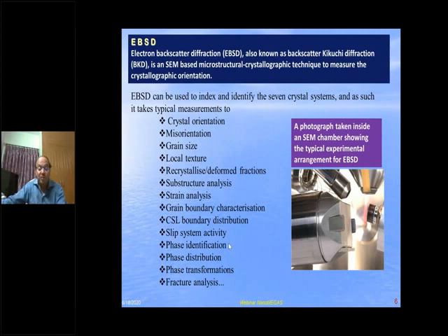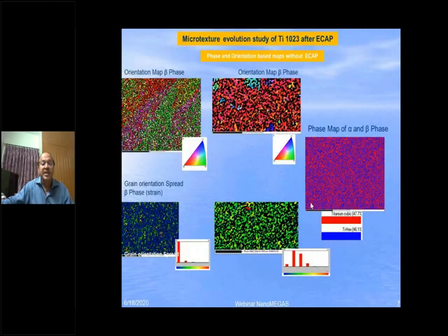But the one which is not mentioned is that in SEM, whatever you see, there is a limitation of size. If the sizes are very, very small, you cannot detect them using an SEM, so it is not possible to detect them in this machine.